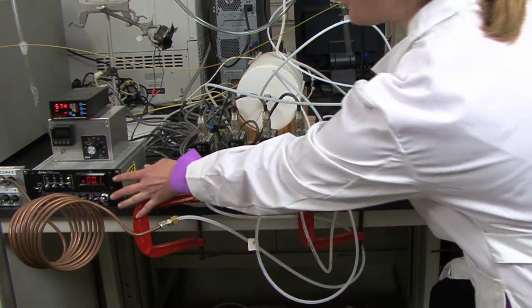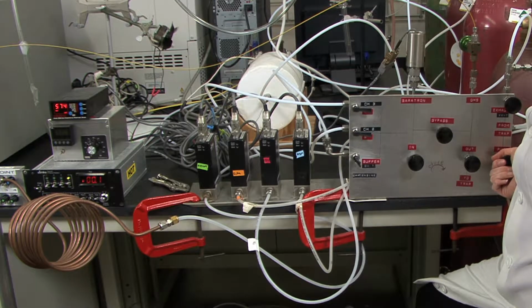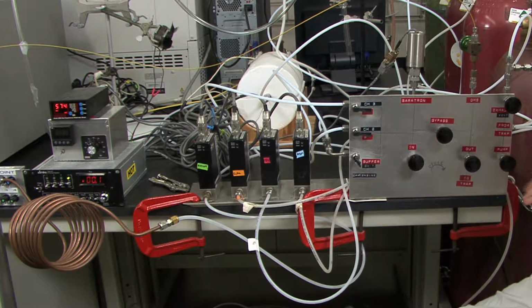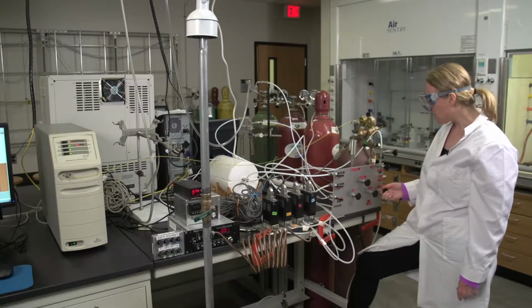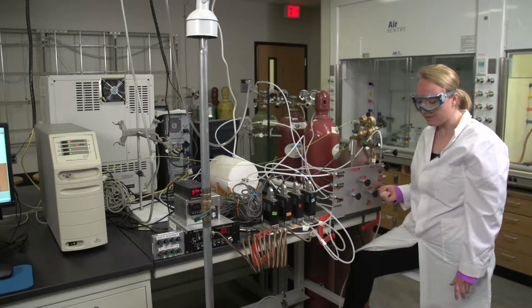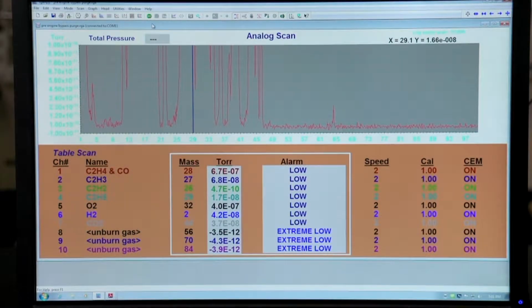The actual flow rate should be about 35 SCCM. It'll probably fluctuate quite a bit, but that'll be good enough. And your lab partner should stay here and make sure that the total pressure stays about 450. They'll probably have to close the pump and build up pressure a little bit and then continue to release it by just barely loosening it. So after your lawnmower is going and the pressure is right, you can collect a scan.